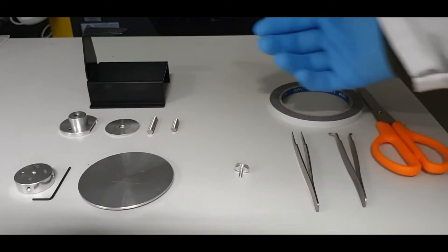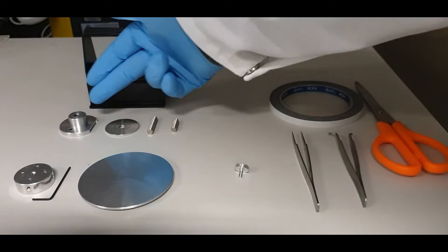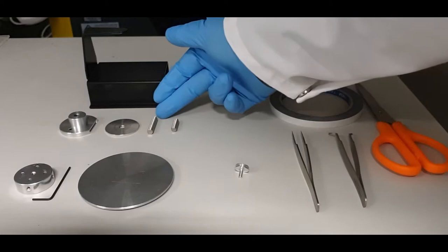To get started with sample mounting for the SEM, you will need out of the cabinet this black height gauge, the base for the sample stage, the locking ring, and one of the two posts — either the short post or the long post.